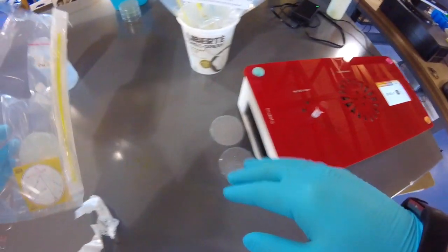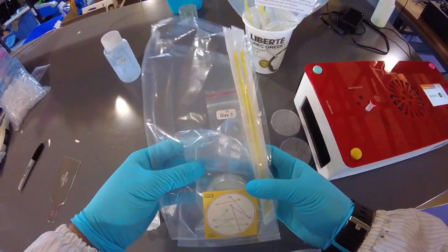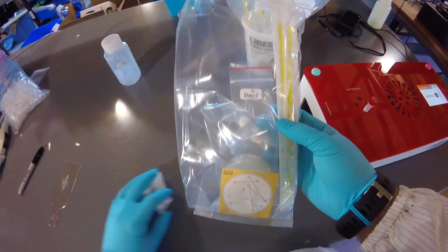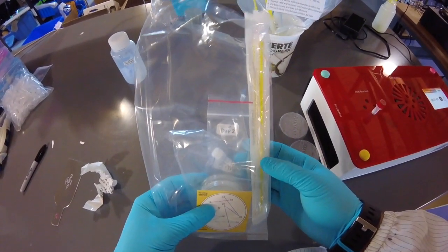We don't need the incubator at all today, so I'm just going to leave these here, and we're done with this for today. We can put this in the fridge for use tomorrow. So that's all for today.